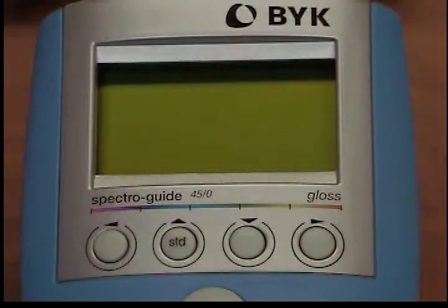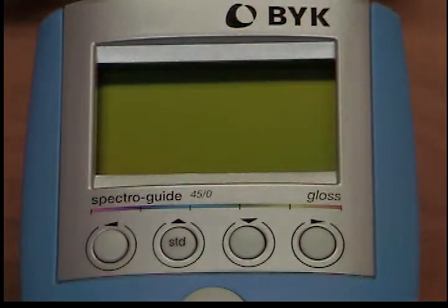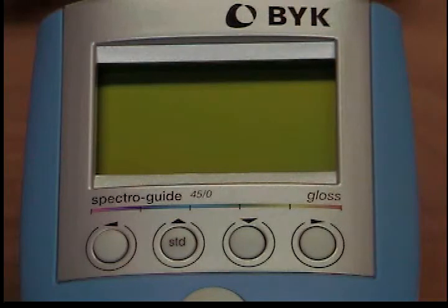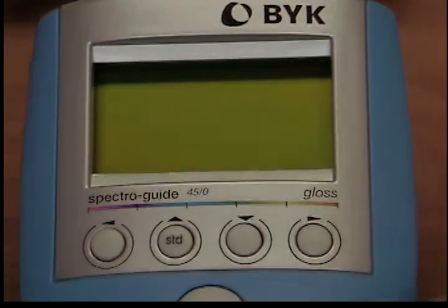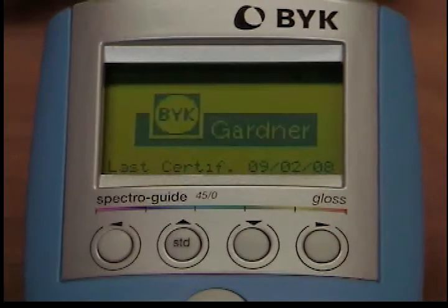Further calibration of your BYK Gardner Spectro Guide. Use the cursor buttons to move the cursor to the top of the menu to the menu option.